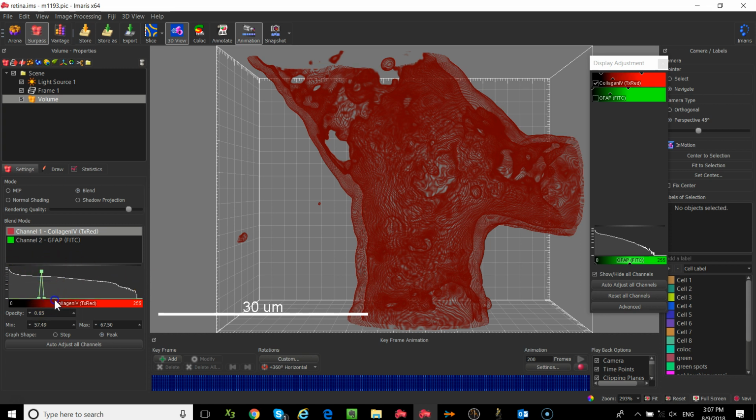So I'm going to bring this out a little bit. Oops. I should look at my screen, not the projector.